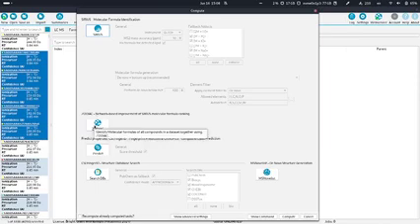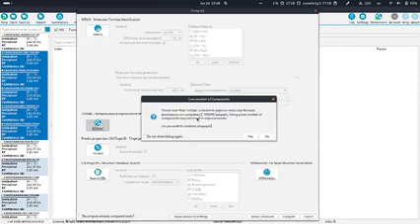If we click on Zodiac, it will show us a box to confirm that we really want to use it, because it is meant for when we have a complete data set with much data measured. It was developed to improve the formula annotation, and it doesn't make sense if you just have one compound or two compounds or something.